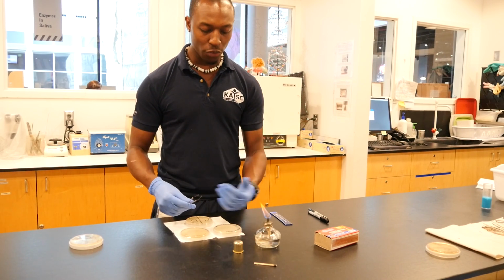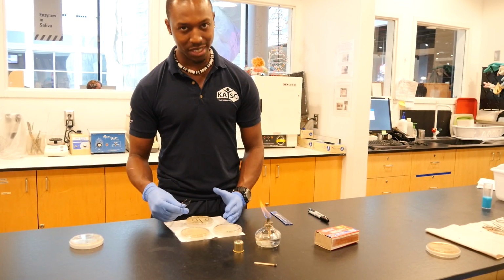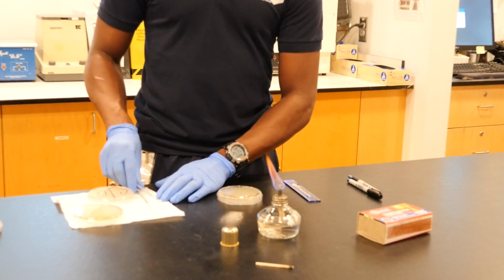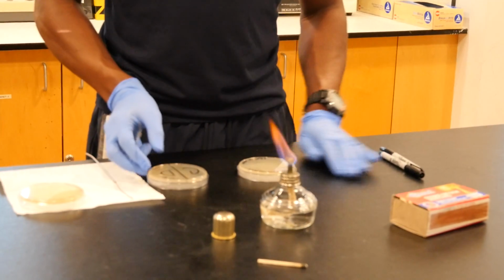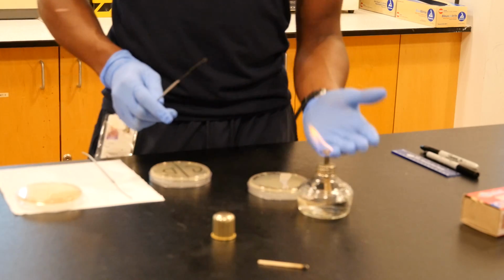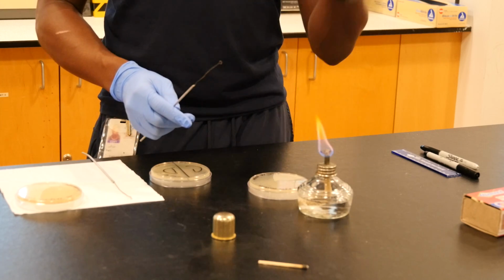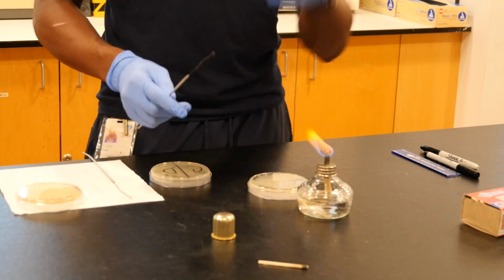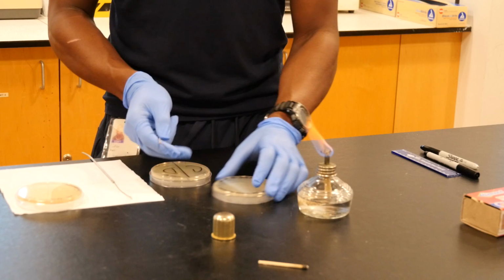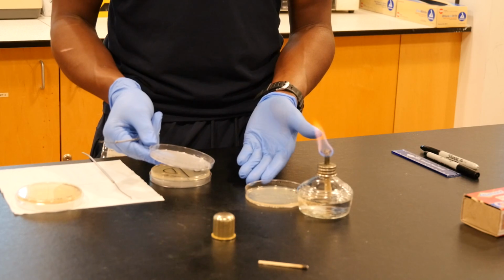Now you have to decide to yourself which bacteria you're going to work with first. Are you going to work with the side of C, or are you going to work with the side of D? In any case, I'm going to work with C, okay? Now I cool that off. I'm going to bring my alcohol burner closer because I'm going to show you guys a trick. As you're working with cultures and you're going to start to streak, okay? You see that the flame is flying up, right? The purpose of doing it this way is because the flame is flying up, which means bacteria is not going to fall down on your culture. So you're going to easily open your culture up and make sure the culture is close to the alcohol burner, okay?